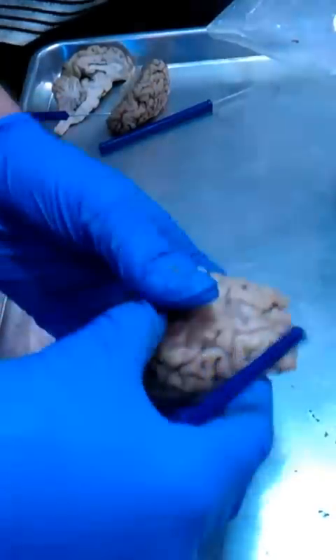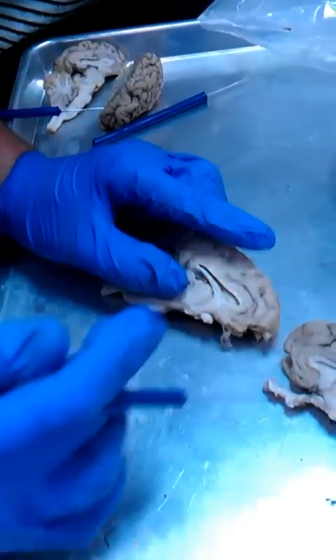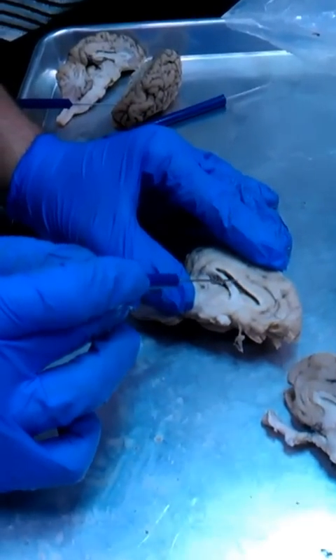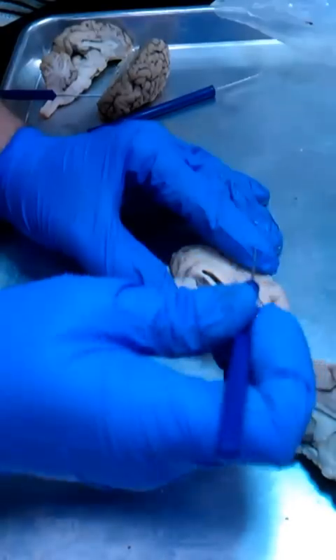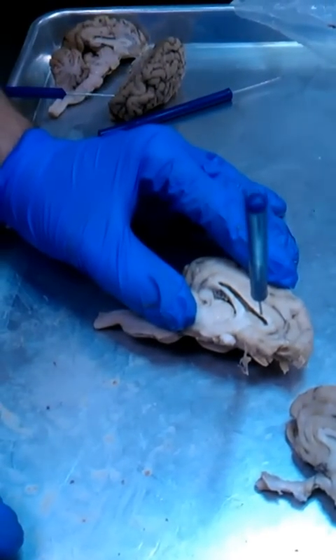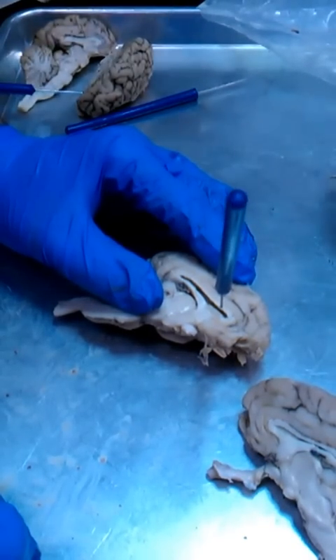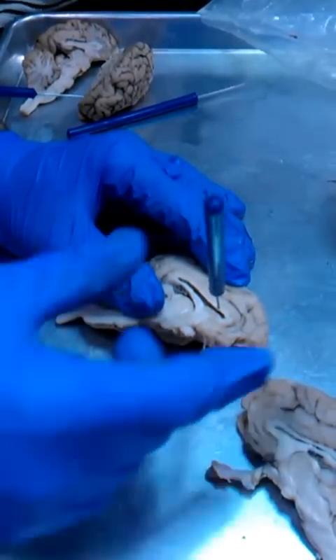If we open it up and look at the inside here, on the inside, this white piece that goes from here all the way across to here, and if I were to pin it singularly, it'd be probably something about like that. Notice the connection between right and left side. It's going to be white matter, so it's one of our tracts we talked about. This is the corpus callosum. The corpus callosum is one of our commissural tracts.